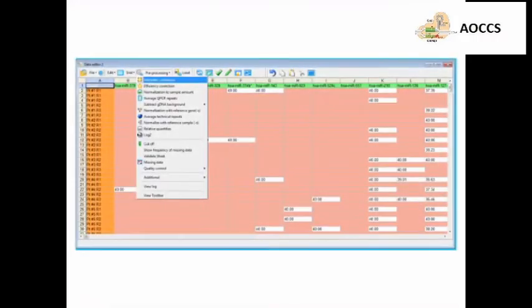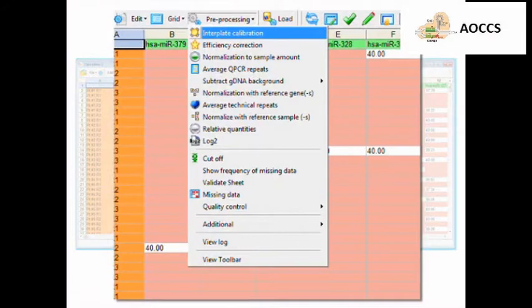First, calibrate the data between the plates by choosing Interplate Calibration from the Preprocessing menu to ensure all of the plates are calculated using the same parameters.